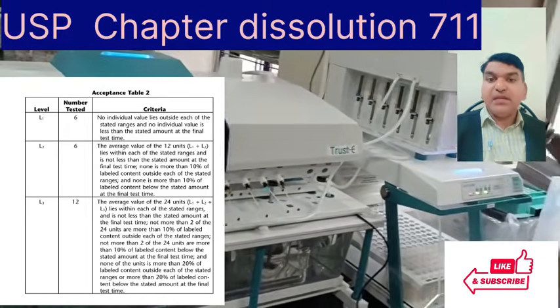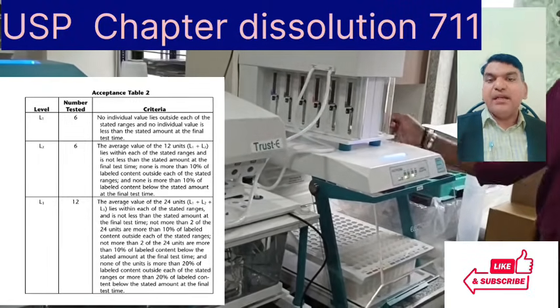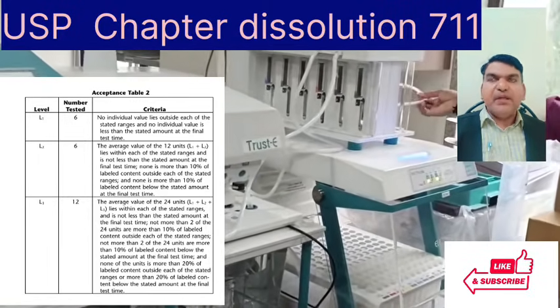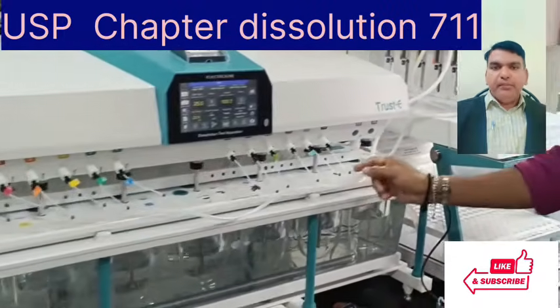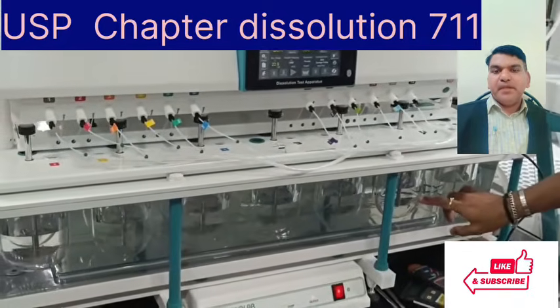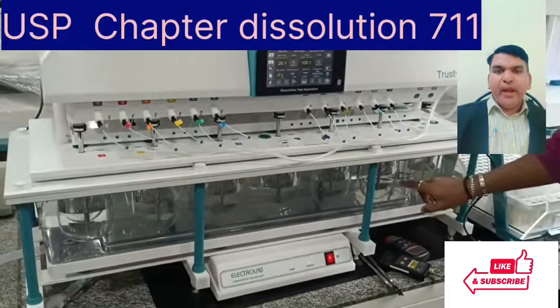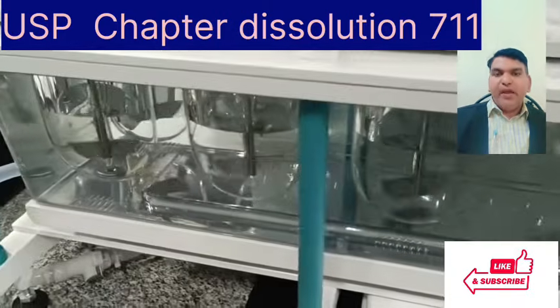If you want to understand the definition of Q in the context of the EP General Chapter 2.9.3, here is the definition. The quantity Q is the specified amount of dissolved active substance expressed as a percentage of the label content. So, again, the EP talks about the percentage of the API dissolved in the dissolution process, and that is all about the Q.